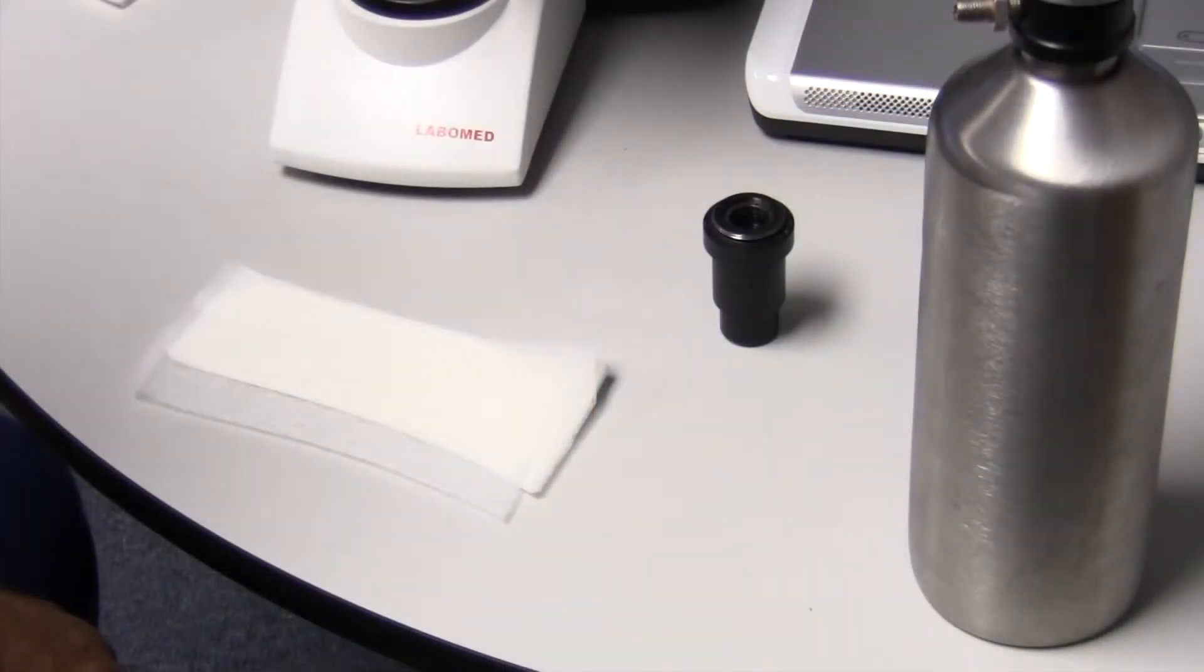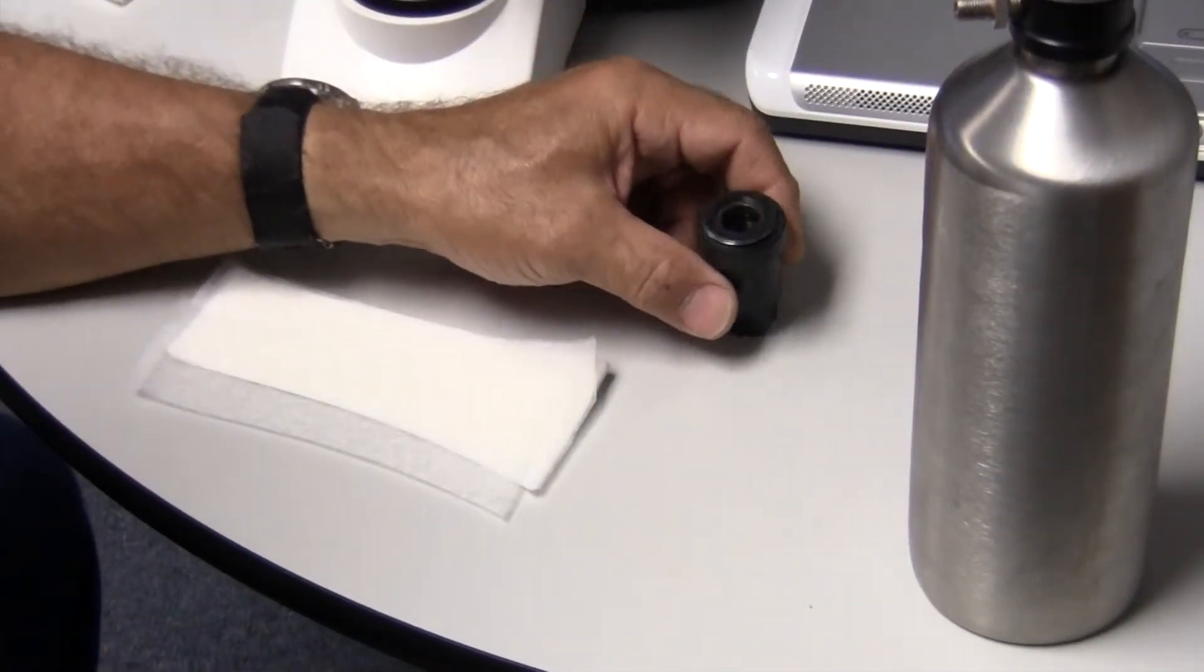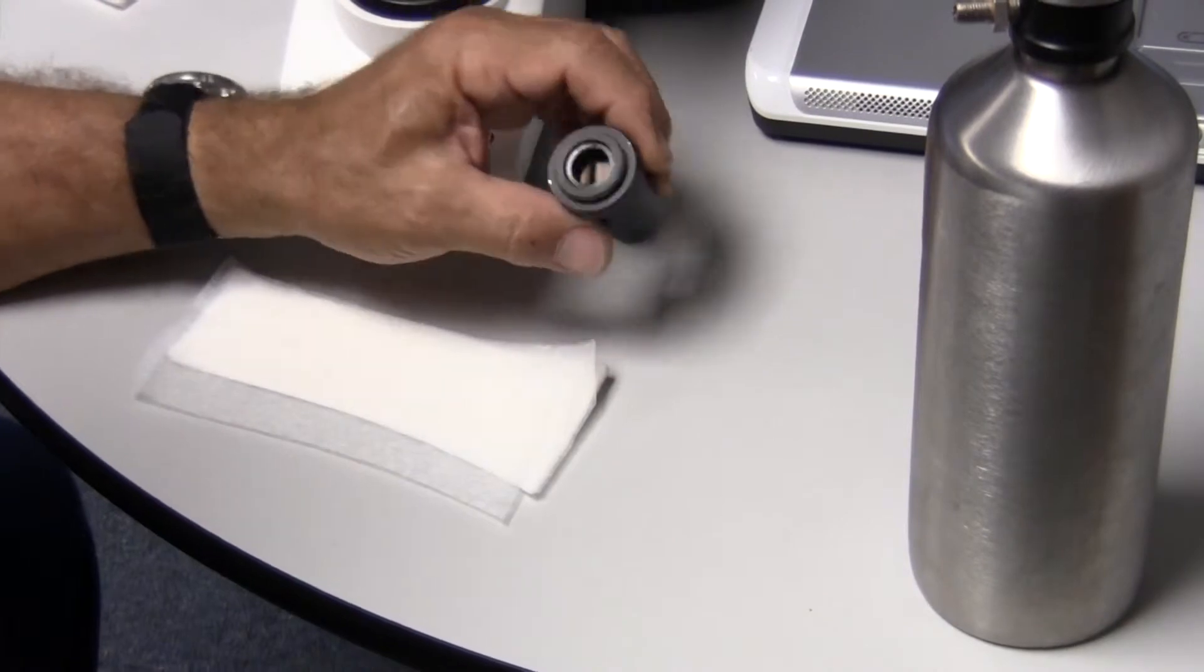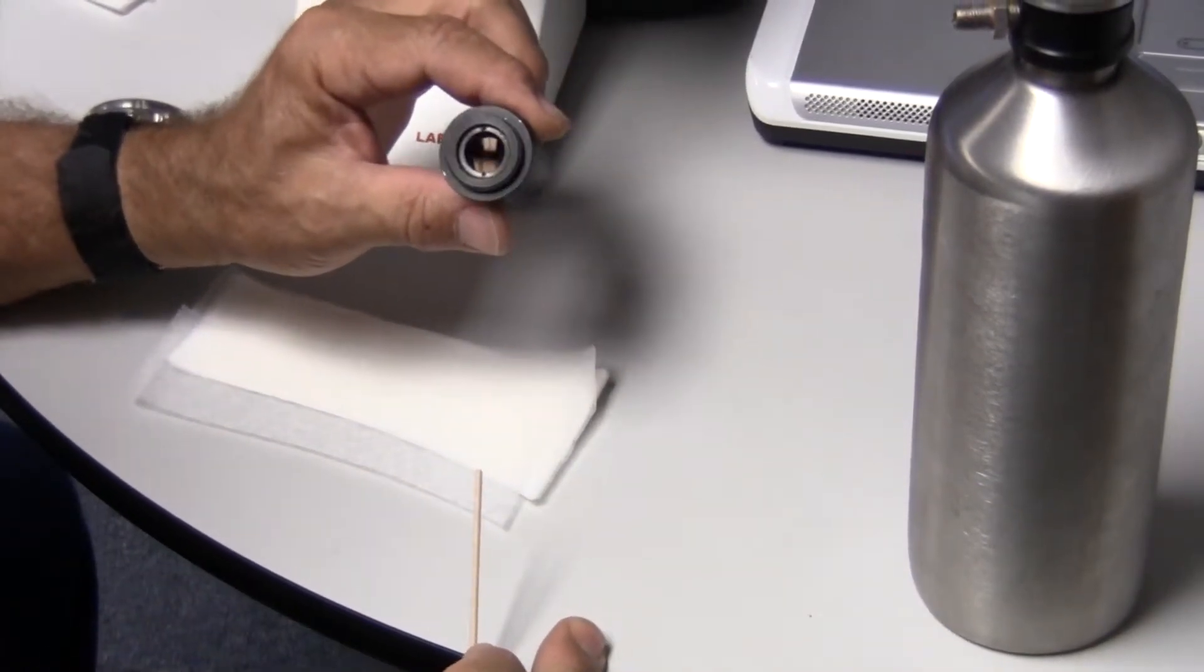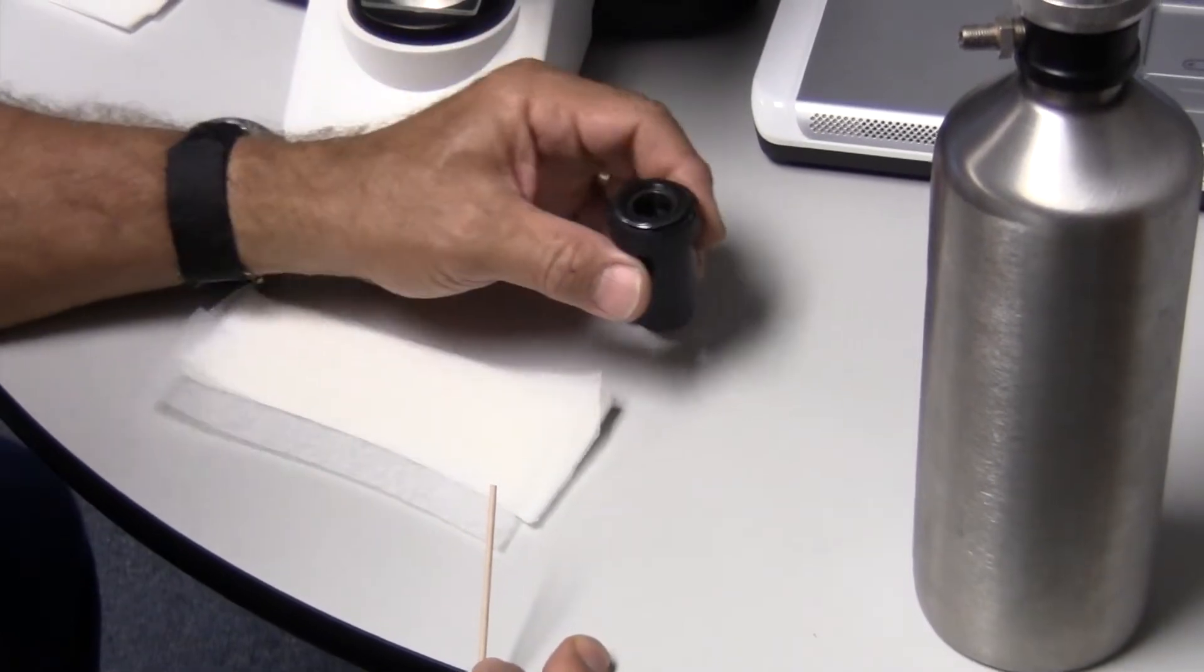Okay, now we're going to go over how to clean optical lenses in a microscope. Because the optical lenses are coated with anti-reflection coatings and other very delicate coatings, it's important to use the right type of paper.